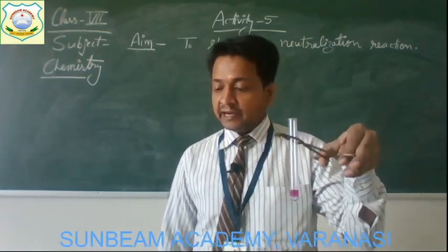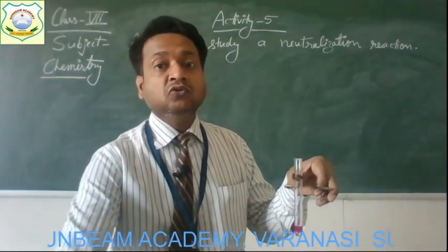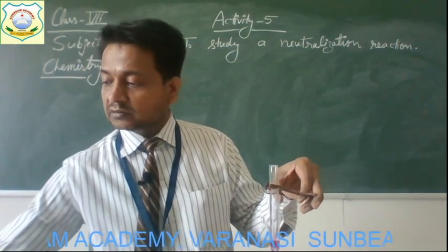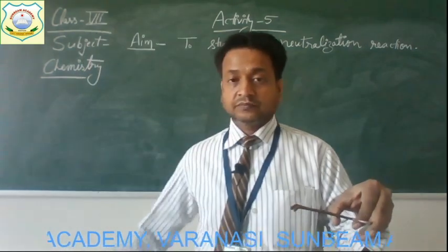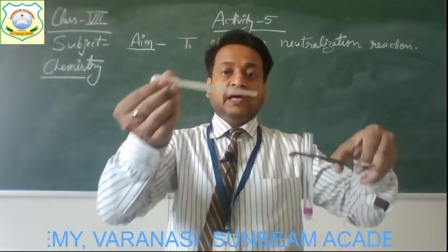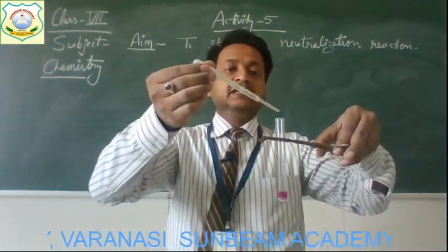Now, I will add dilute hydrochloric acid to it with the help of a dropper.